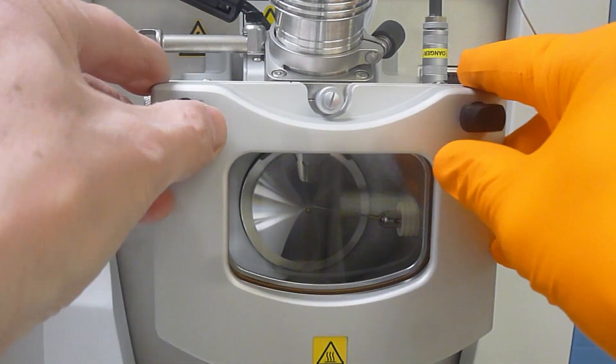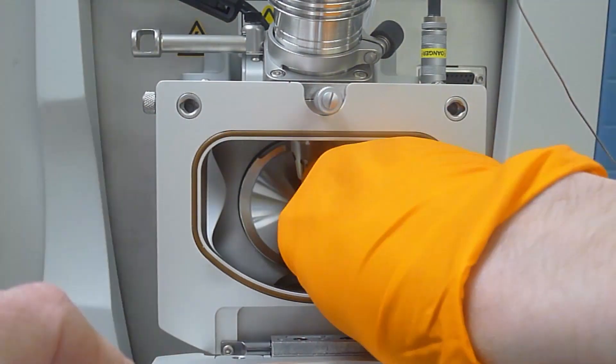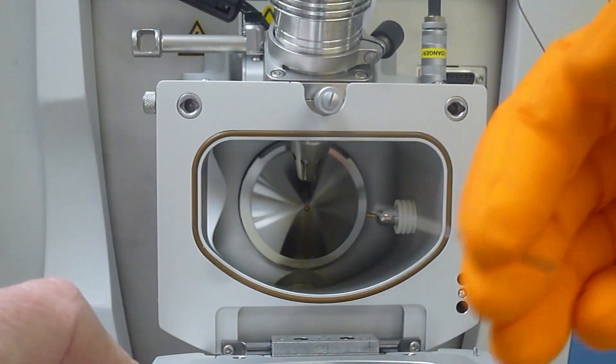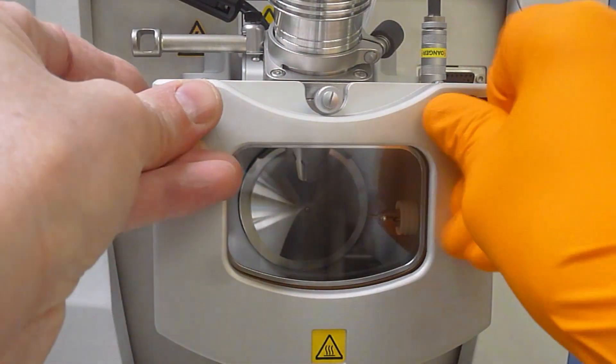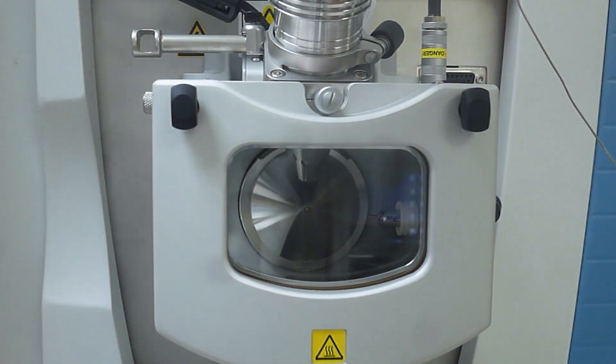To remove the APCI probe, first open the front flap by turning the black knobs and remove the APCI pin. Then you can close the front flap again. Secure with the two black knobs by a quarter turn.